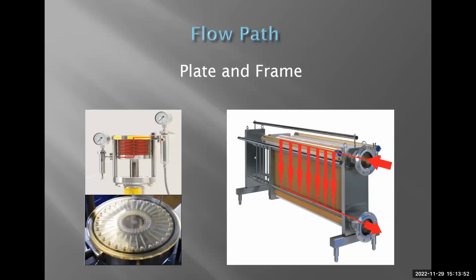The flow path for different plate and frames, they vary a little bit from skid to skid. Typically, they're going to be like the picture on your right, where feed comes in through the one side of the membrane. You have uniform flow down each channel, and then the retentate comes out through the other side of the skid, and your permeate is collected along tubes on the skid itself.